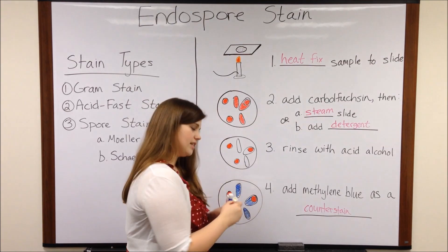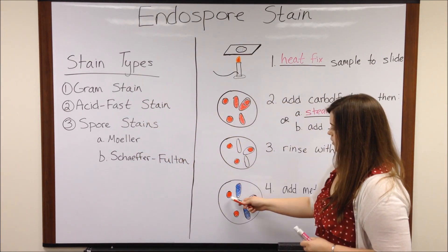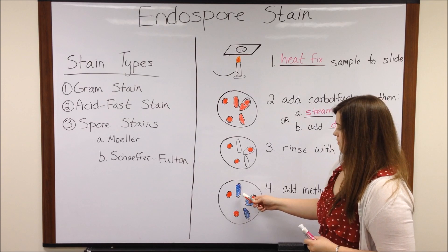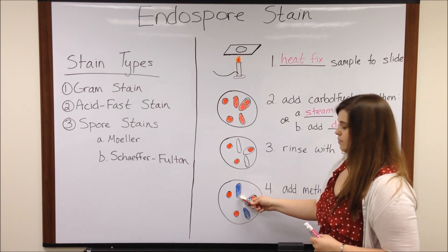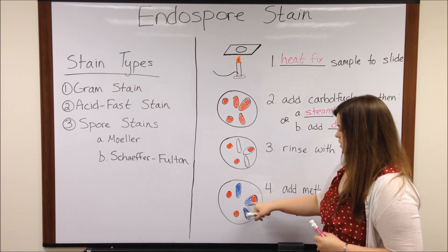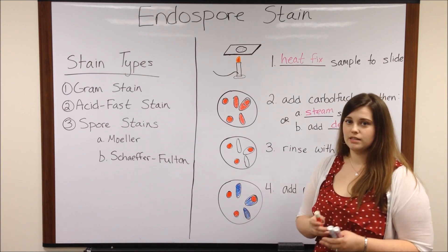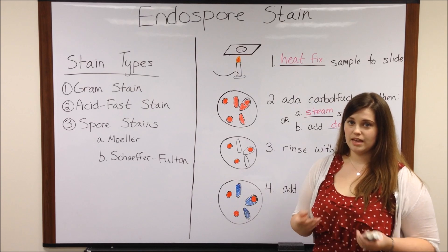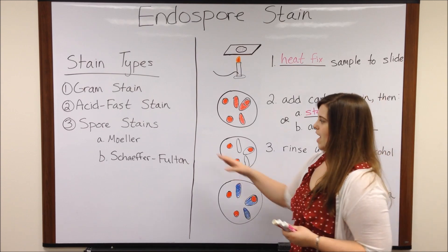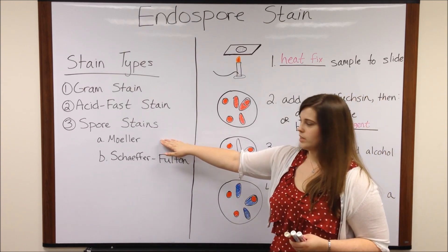So with a stain like this, you can see red endospores. You can see blue vegetative bacteria. You can even see bacteria that are in the process of forming endospores. So that is the Molar spore stain.